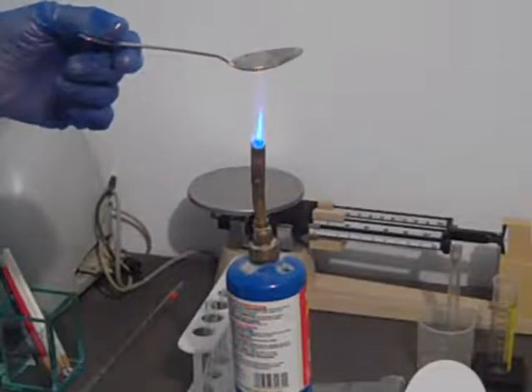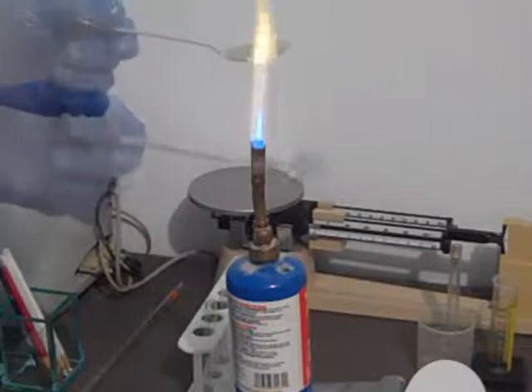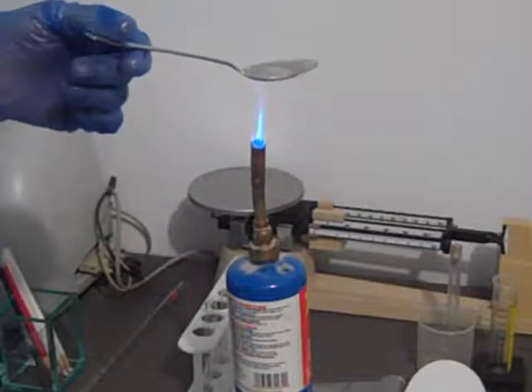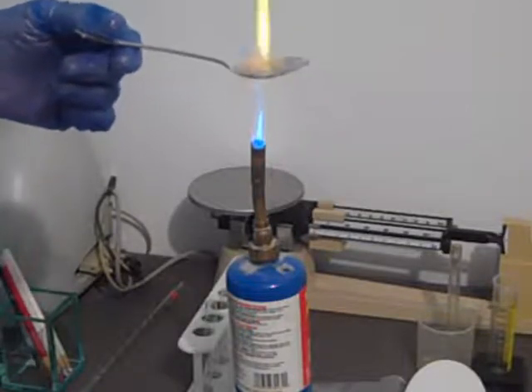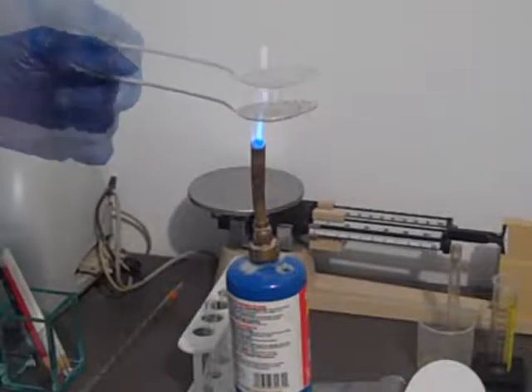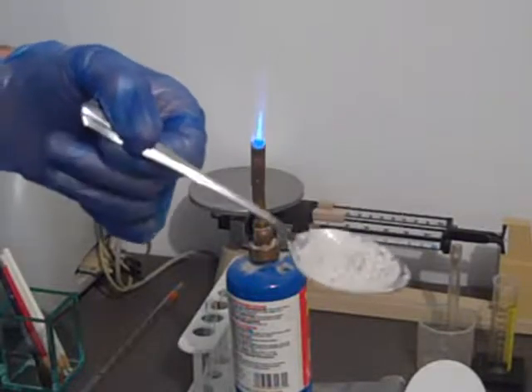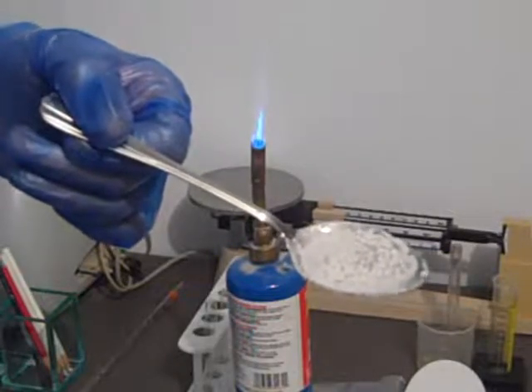The flame is a little bit hot — a little bit faster method than using a dish. Here you see the crystals of sodium chloride that have formed — the salt that was in the water.